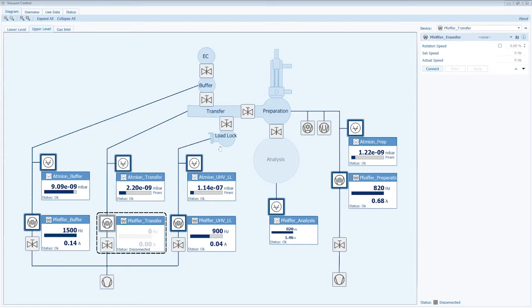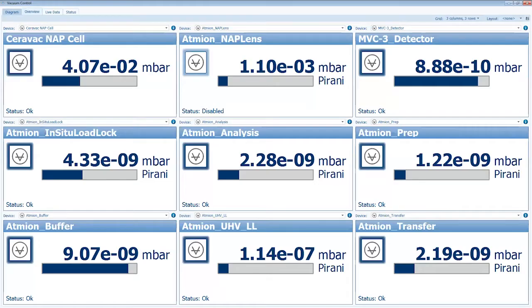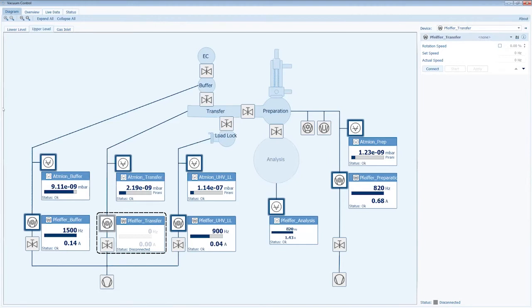Okay, you see here the load lock. We put the sample in and transfer. This buffer is the electrochemical cell, then the preparation chamber, and now the sample is in the preparation chamber, and we are going to move it from here to here. For this, you have to open this valve between the two chambers. That actually has to be done manually by ourselves because there is no software for that.